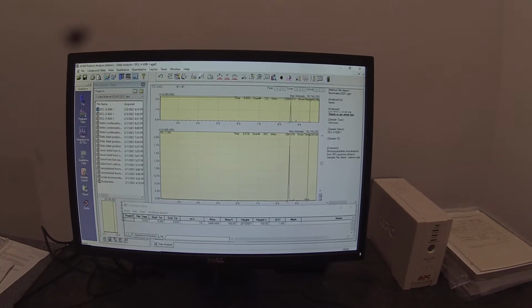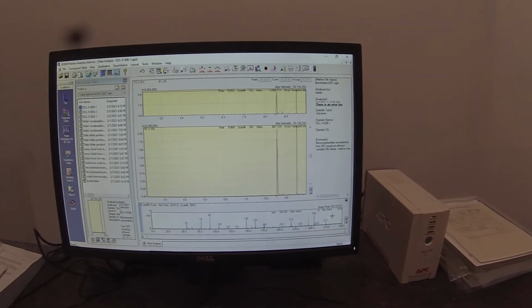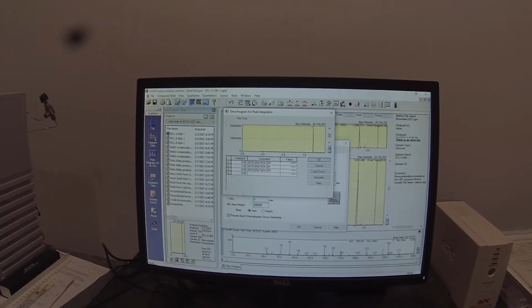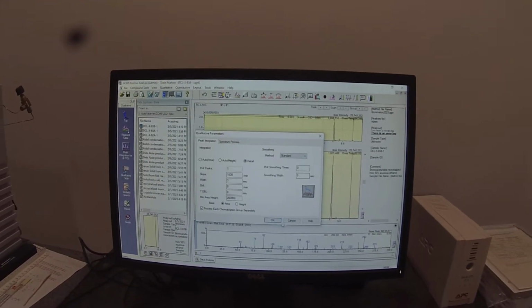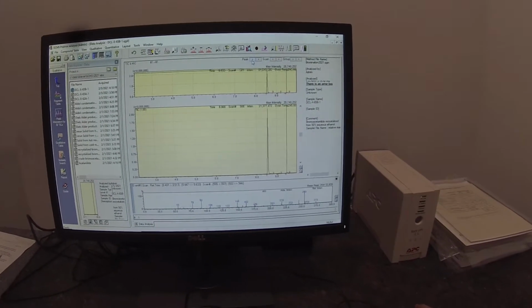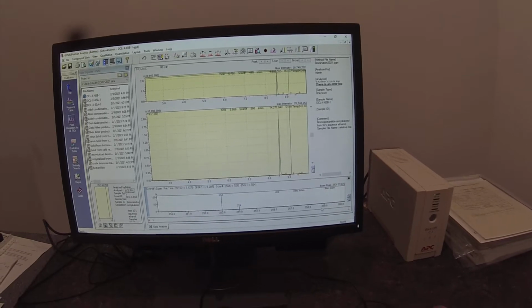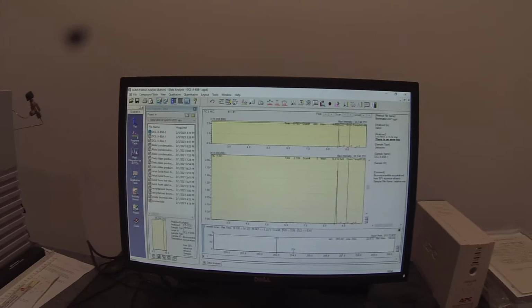There is a peak here, and it looks like a molecular weight of about 273, but it's tiny. I'm going to go ahead and, in the peak integration, not turn the integrator off at 9, to see if I can get it to pick that peak up. Yeah, and it is picking up a couple of extra peaks here. One there and one there, 253. This one almost looks like it's got a 253 and 254, so that's not an M and M plus 2 peak.